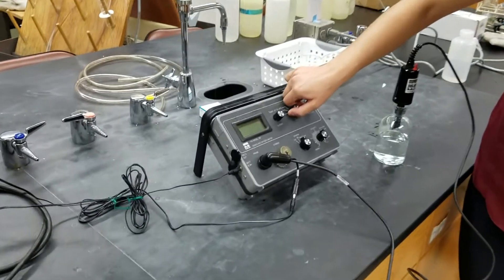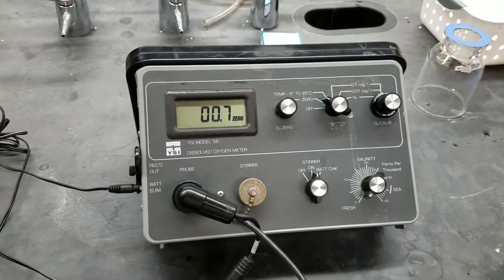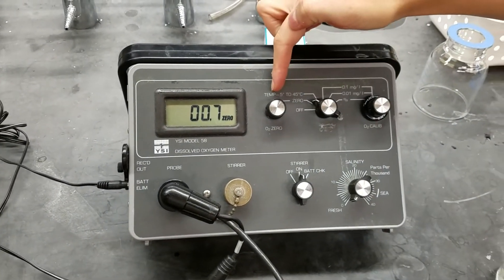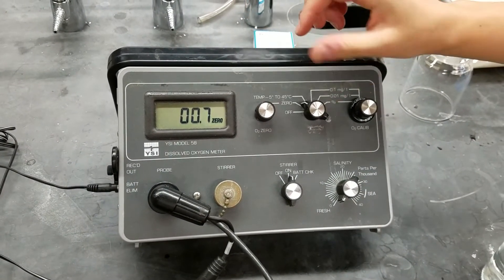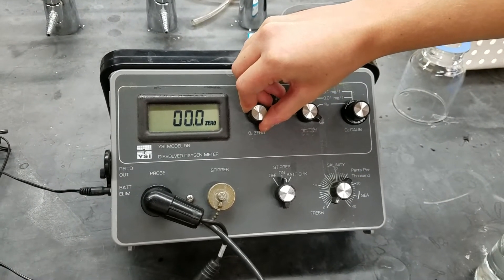So we turn this knob to the setting called zero. And we want our dissolved oxygen reading to be zero here. So we'll turn this knob here until it's at zero.